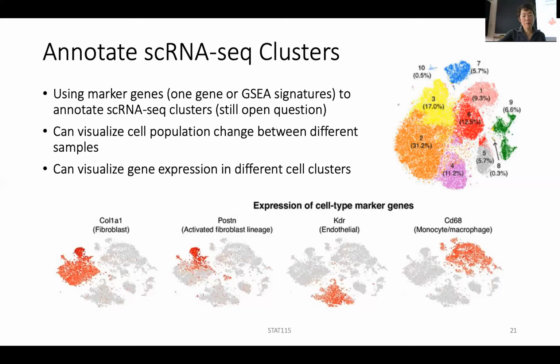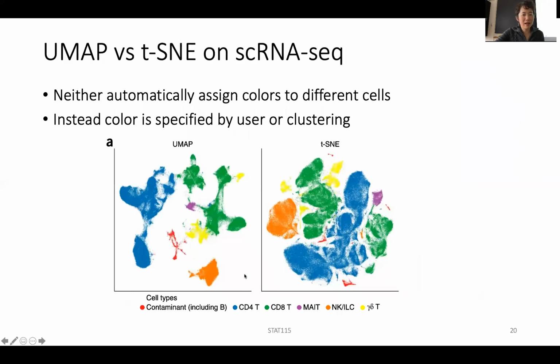There are also algorithms to say, okay, this group of cells has a unique signature, and sometimes you can use it to identify a new single cell cluster, a new cell type that people didn't know before. So imagine this is your CD4 cell. Previously, people thought it's all CD4, but if you look at a finer resolution, you say, I think this is a new cluster that people never knew, some intermediate stage between this cell and the next stage.